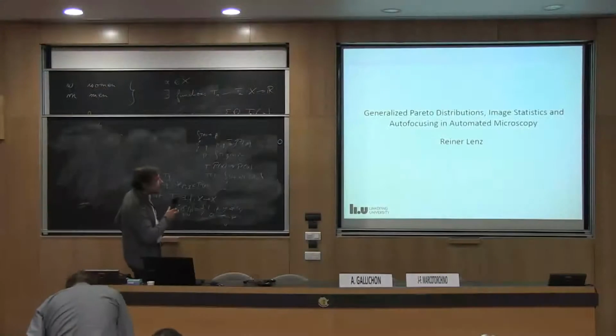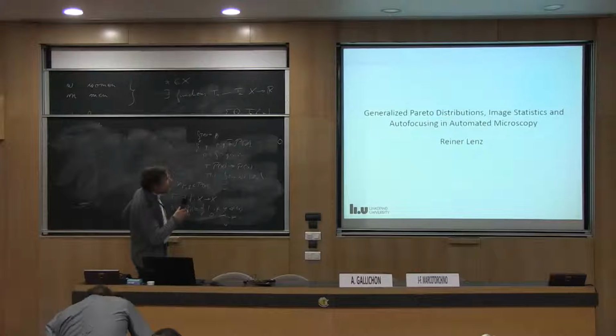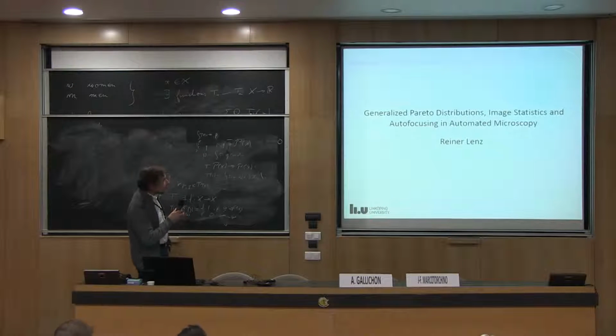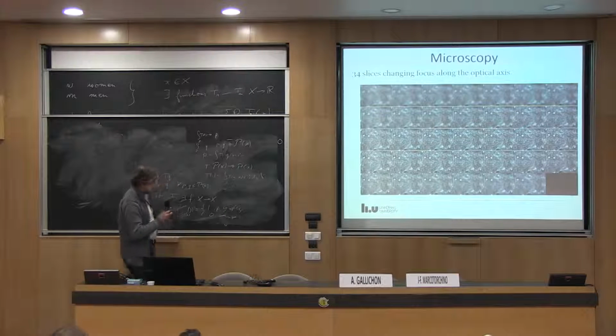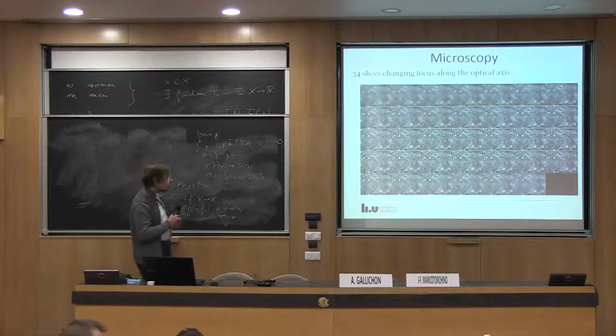In the title, there are 4 key concepts: Pareto distributions, image statistics, autofocusing, and automated microscopy. But since I have a little bit more time than I initially thought, I think I will say something more general and put it in a wider context.